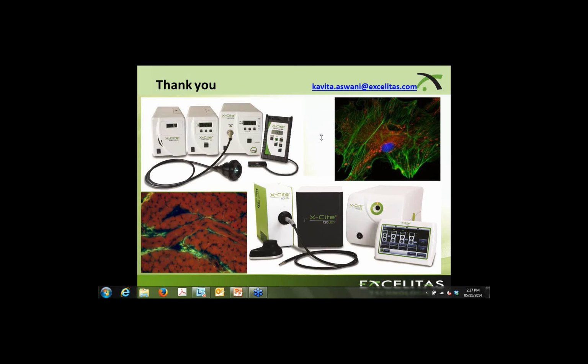Yes. So basically, what the question was, what do you mean when you say you don't need filters with LED? If you have a white spectrum LED, you absolutely do need filters within your microscope. If you do have a multi-wavelength LED where the LEDs are within a unit, you can then filter the excitation light before it enters the microscope and then put your multi-band dichroic and your multi-band emitter in the microscope. That way you can switch the LEDs very, very fast and capture your images and not have to rely on the movement of a filter turret. So I hope that's clearer.